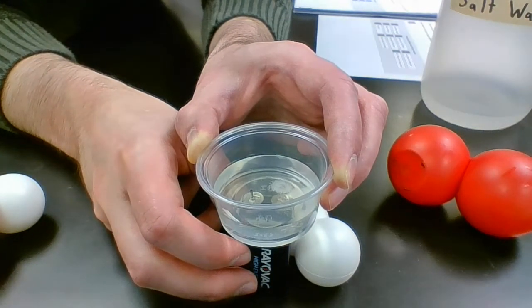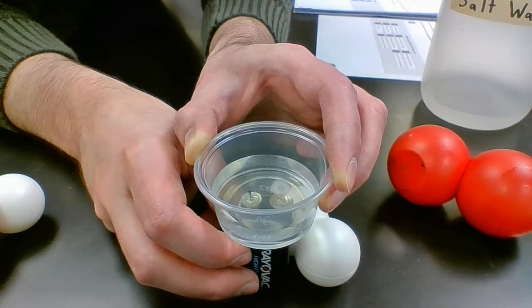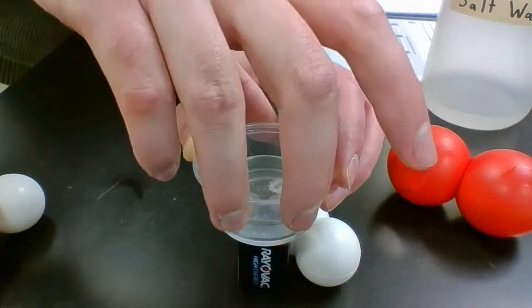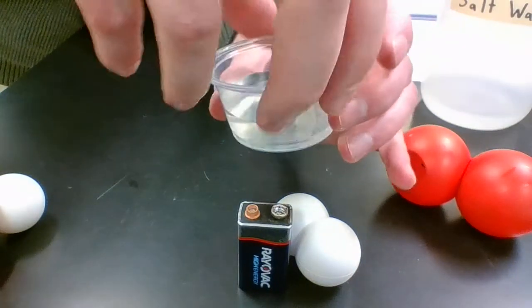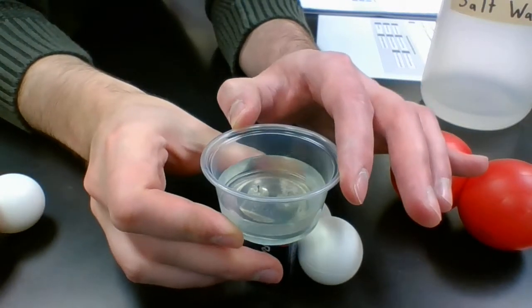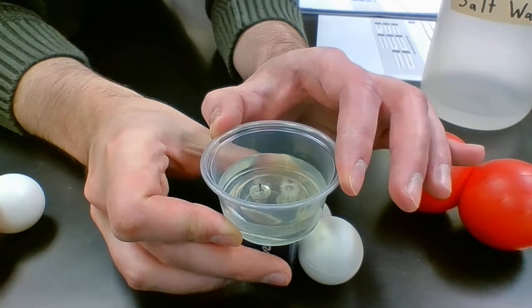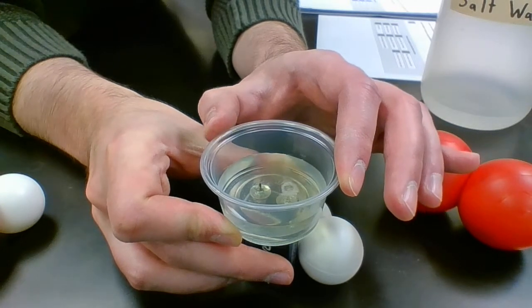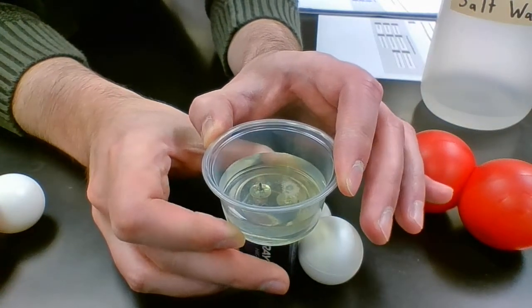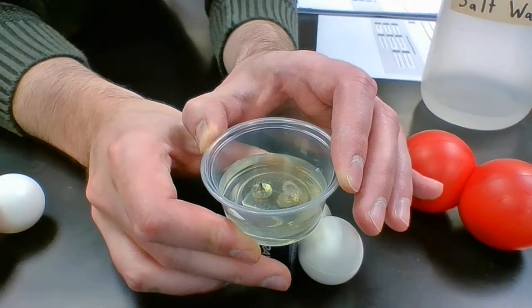Now we can't see the bubbles, but we can see a product of this change as the color of the water starts to change a little bit. To loosen it up, I'm going to switch the sides of this so I can push some bubbles through the other tack and hopefully break some stuff off here. Now I don't know how good the camera on my laptop is, but if it is, you'll hopefully be able to see that we're getting a greenish bluish color in the water now. That's from little bits of corroded metal breaking off and floating into our cup.